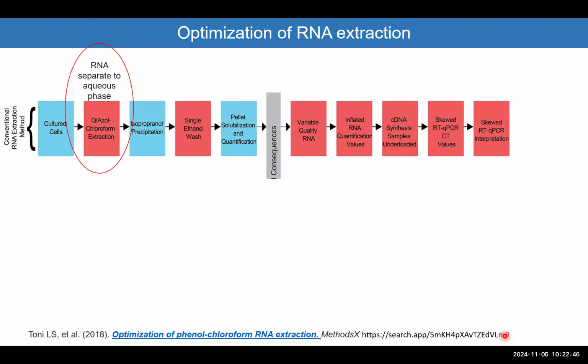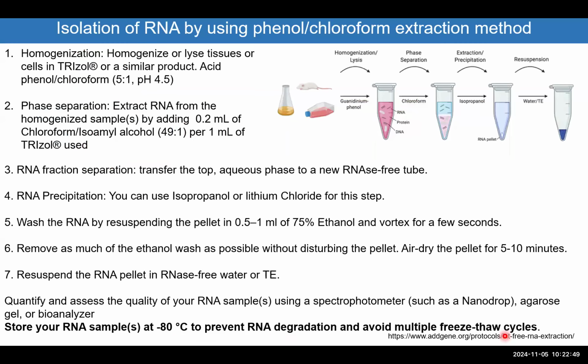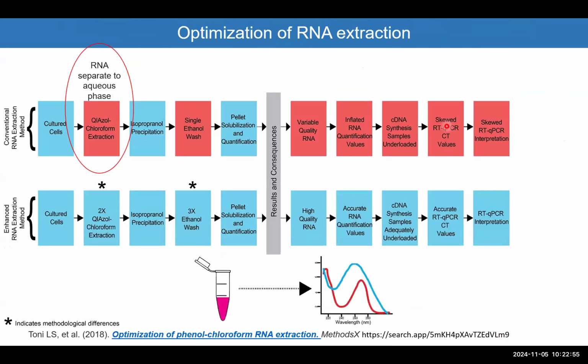And we discussed that you can optimize the protocol. So imagine you are doing this step and you carried some of the organic phase, all you need to do is just repeat this and you will get a better quality RNA.